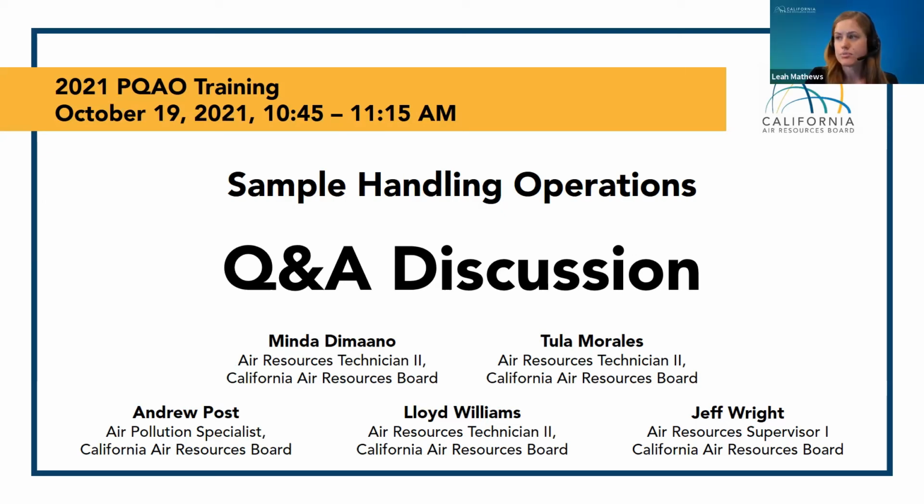What products or machines are utilized by the sample handling team to perform washing of the filter holders? We have some laboratory grade washing machines, dishwashers, not washing machines.